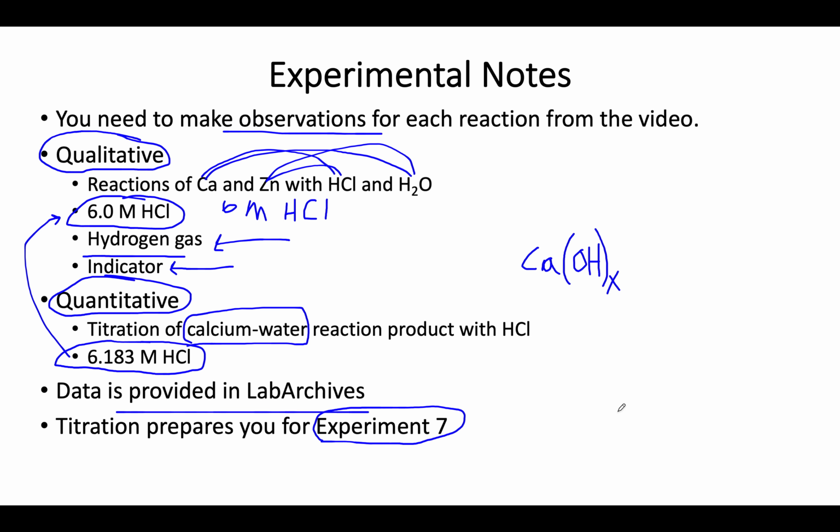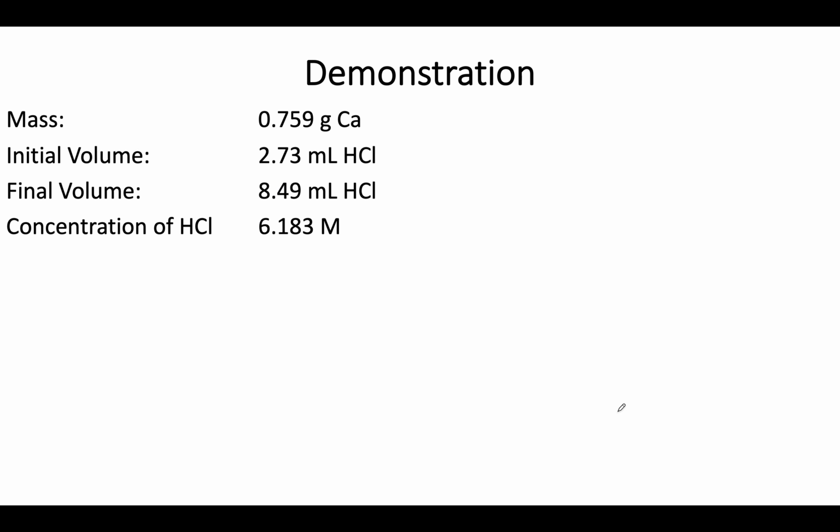that experiment. So if we were doing this in lab, I would actually demonstrate the whole thing to you. I would get up, show you the burette, show you the setup, show you how to rinse everything, how you're ready to go. We can't do that here, that's why you have the videos to see this, but I can go through the calculations, and I would do this as well if we were in lab.